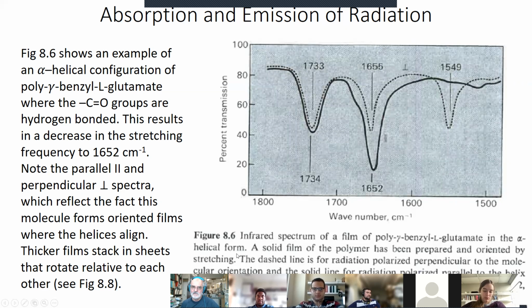Most infrareds, I'm not aware of one being here on campus. There's a device over in Belhaven in Reed Bishop's lab, and he will make films on a lot of stuff. He will compress the sample into a dried film and then take the spectra through the film. Here's an example of the hydrogen bonding signal. Remember up above, it was showing you the difference between non-hydrogen bonded and hydrogen bonded transitions. Okay, so it affects the electronic configuration.